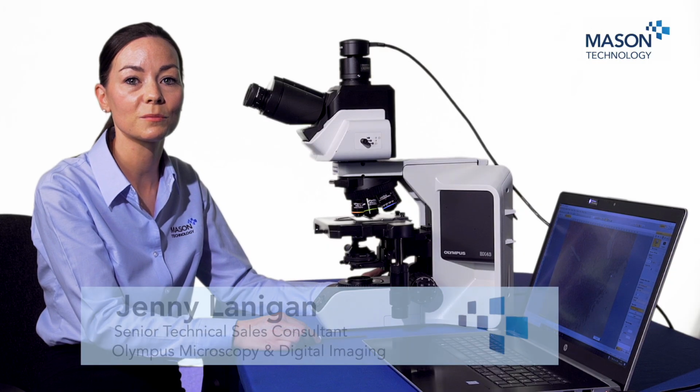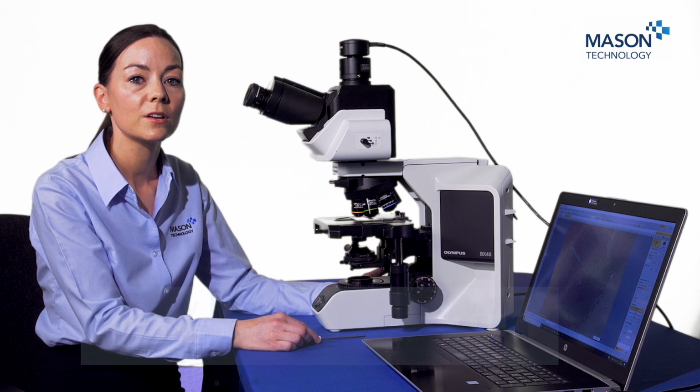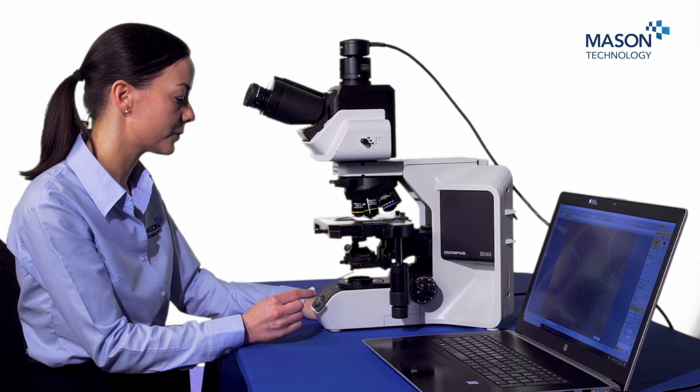Hi, I'm Jenny Lanigan from Mason Technology, and in this video we're going to talk about Köhler Illumination. Köhler Illumination is the optical alignment of your microscope. So I'm going to first show you some important components that you'll need to know.